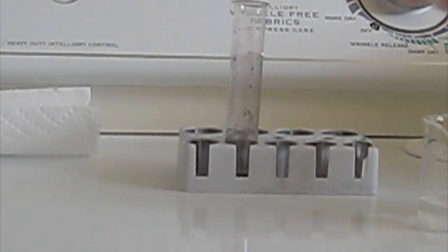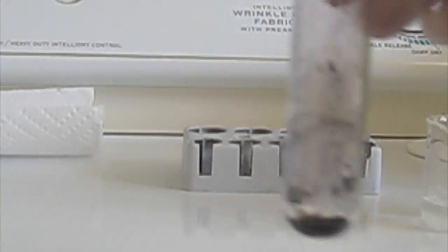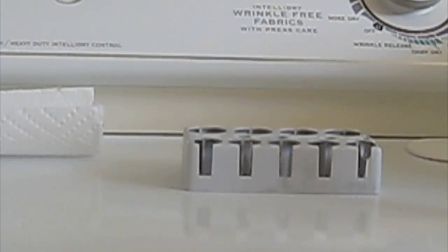I'm not going to keep my iodine because it's relatively toxic and can produce some nasty vapors. You can see it's purple. Those are purple iodine vapors. So I'm going to show you how to dispose of it.